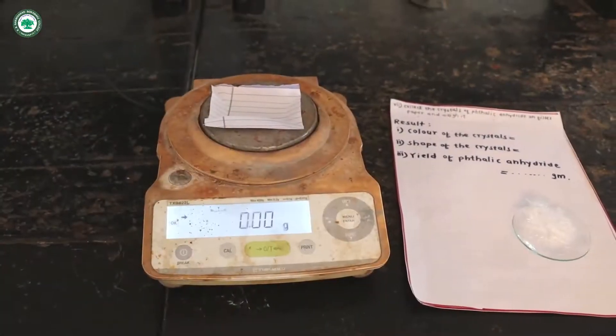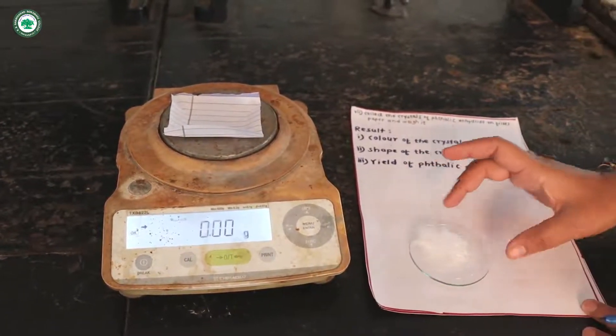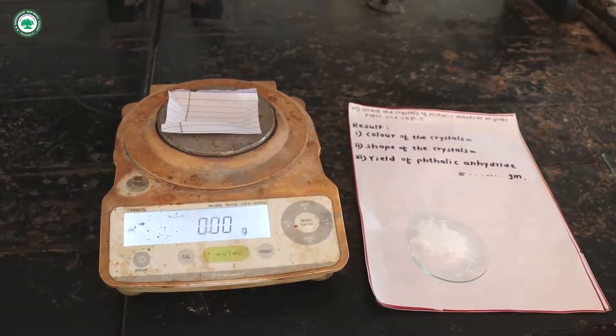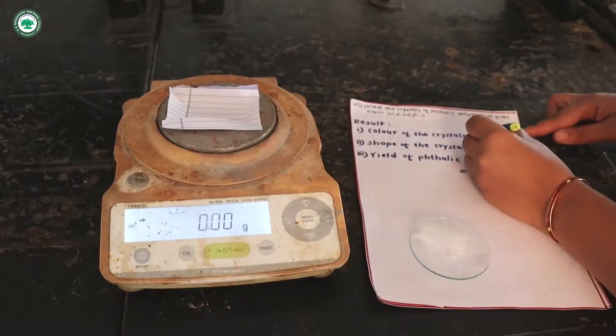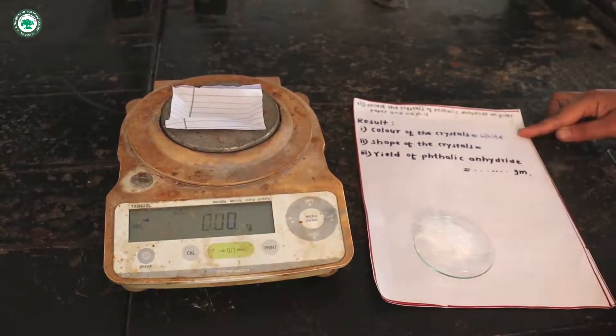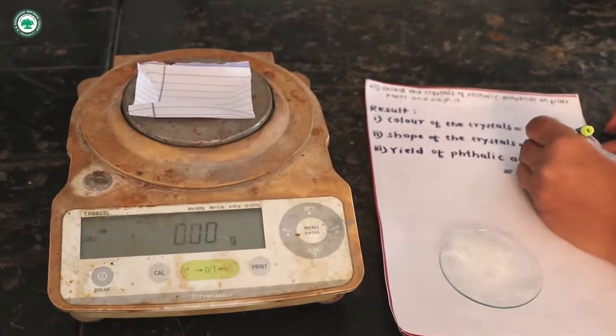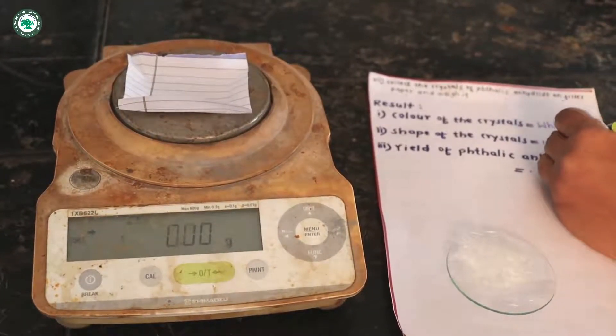After cooling, the phthalic anhydride crystals, I have collected these white color crystals on the other side of the funnel.